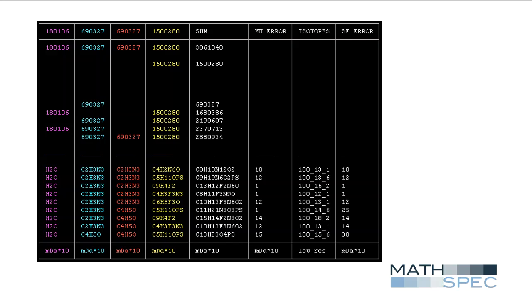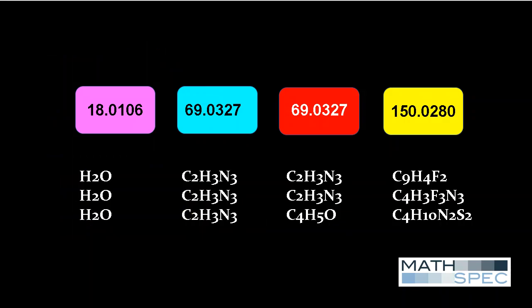Now, for many studies, for example identifying reaction byproducts, this is as far as this data can take us. With this new version of our partitioning software, we generate partitions and possible subformulas independent of any database.